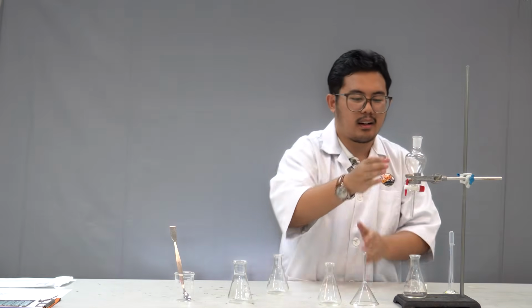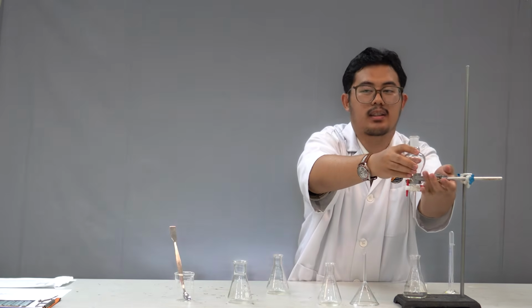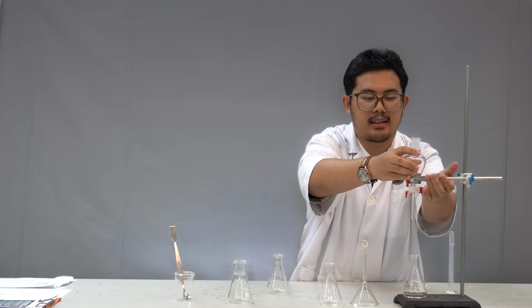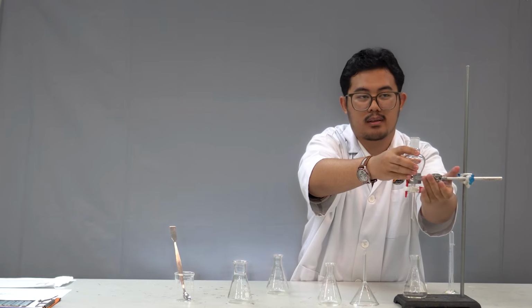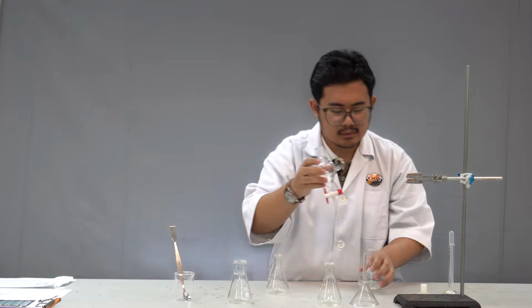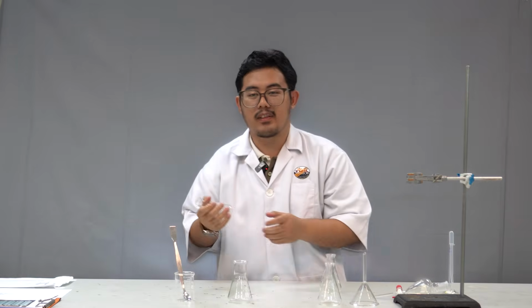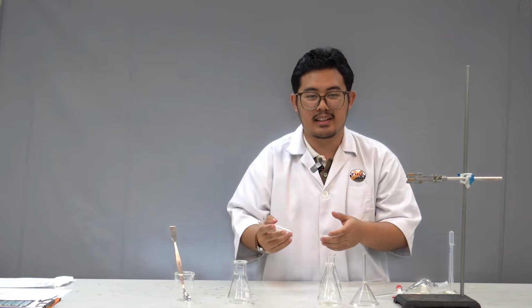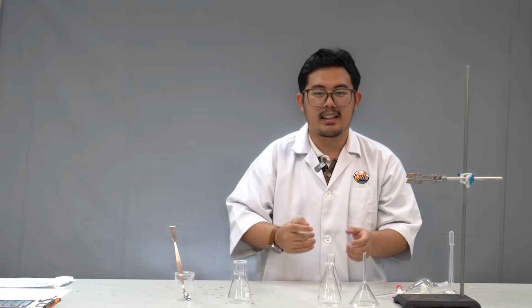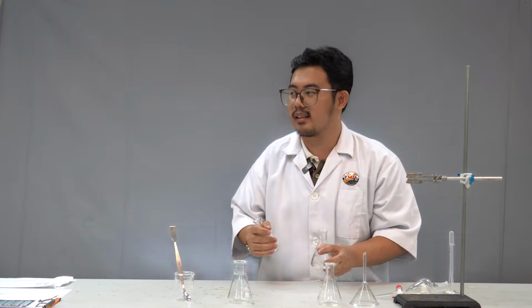And then we have 3 conical flasks with acid, pure base, and neutral, well, not pure yet. In this case, neutral still has some leftover base. So just like the separation of acid, this could also be done repeatedly until you are satisfied with the extraction.